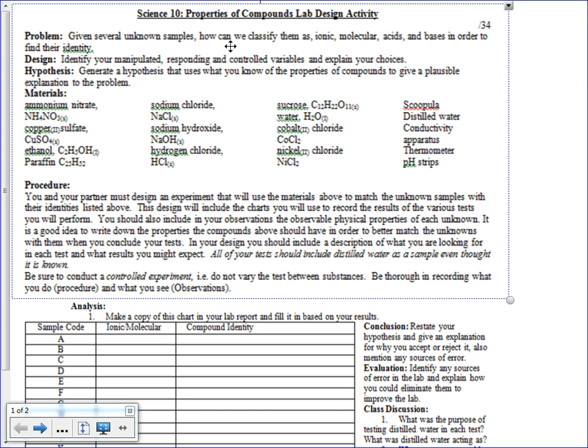That's how I write a procedure for you guys. I hate to say that, but okay, I write it out with every single little thing, so that there's no chance that it can really be screwed up along the way. So you start out with stuff that's very simple, like, acquire the necessary materials from the list. That can be your first step, okay?